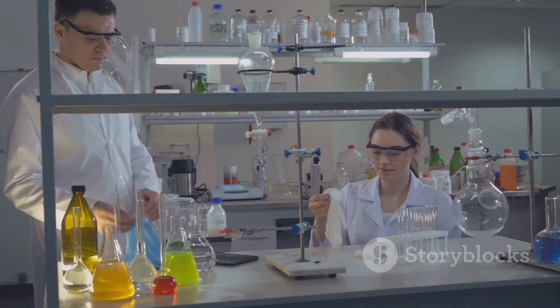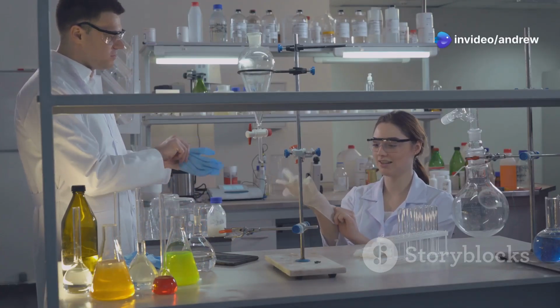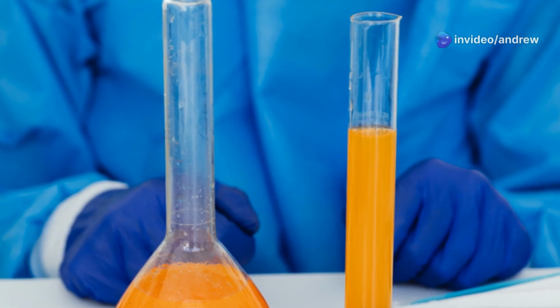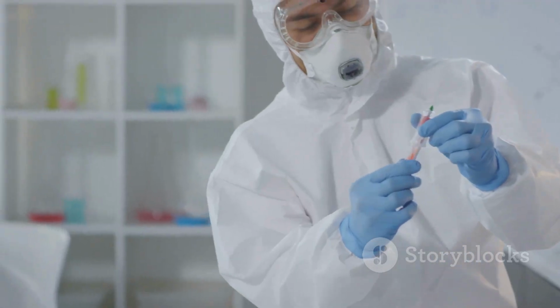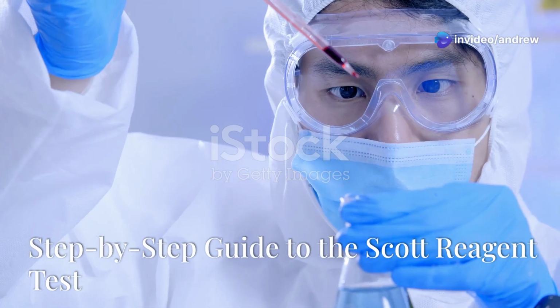To perform the Scott reagent test, you will need Scott reagent, which is typically prepared in two parts. Scott reagent part A consists of cobalt thiocyanate dissolved in water and glycerin. Scott reagent part B is concentrated hydrochloric acid. These chemicals should be handled with care as they can be corrosive and hazardous.